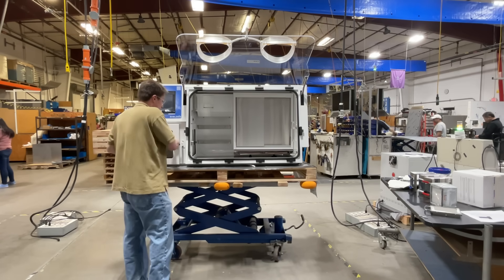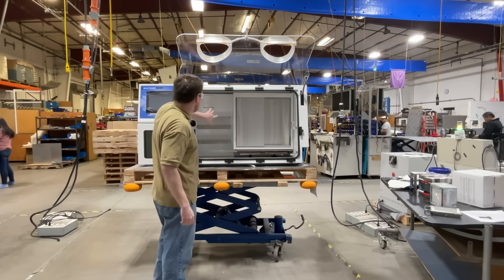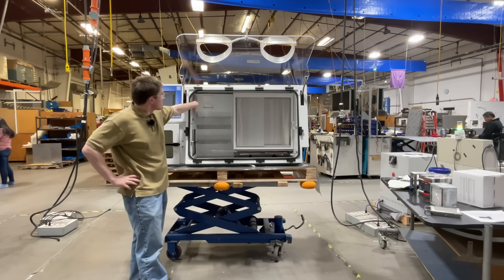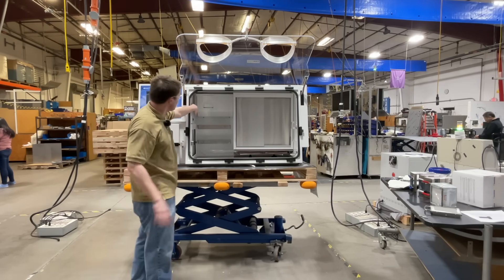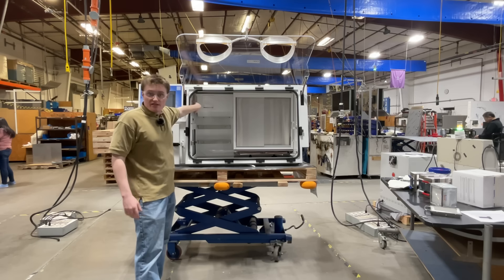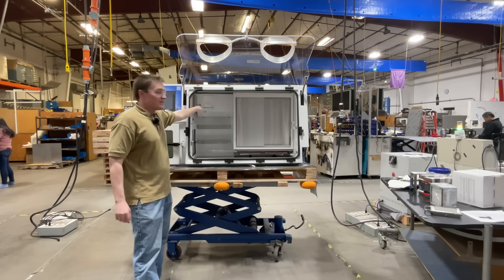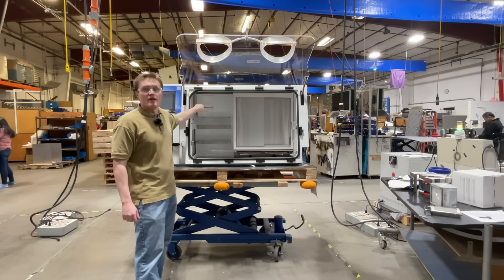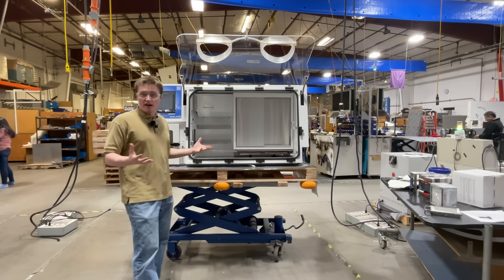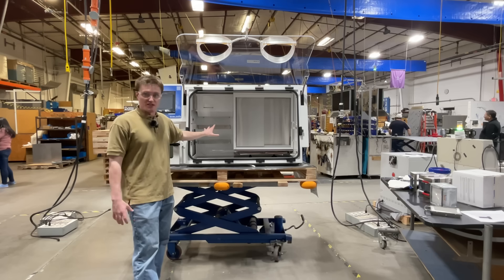Next, we'll discuss our catalyst assembly. Located here is the palladium catalyst. It scrubs oxygen from the workspace while it's in operation. In addition, the Bactron 400 has an activated carbon scrubber also within this assembly. This will remove volatile organic compounds that are produced while you're culturing samples.